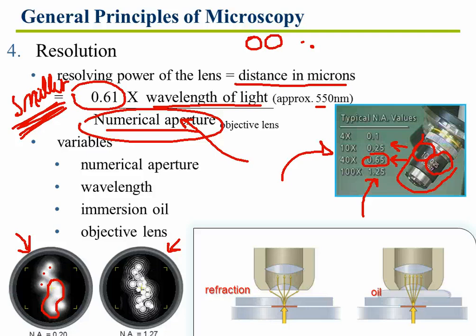Now on our microscopes up in lab, for most regular bright field microscopes, of course you're going to get your best resolution using a 100x, and the resolution on 100x is 0.2 microns. Meaning that if your objects are at least 0.2 microns in size, or the distance between them is more than 0.2, you will see these two objects, this guy and this guy, as separate.